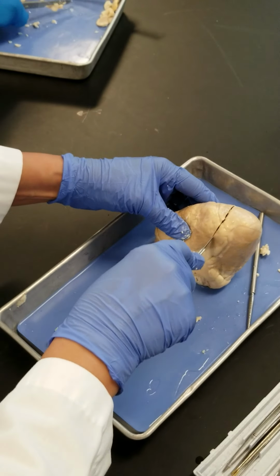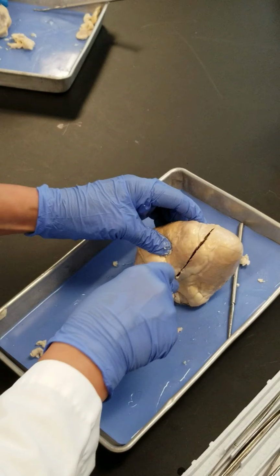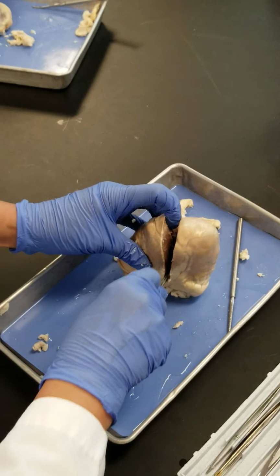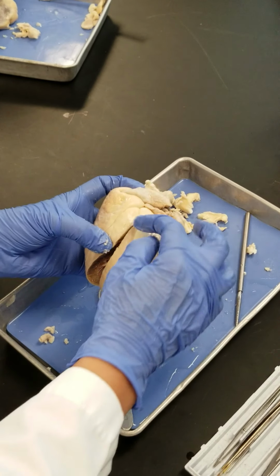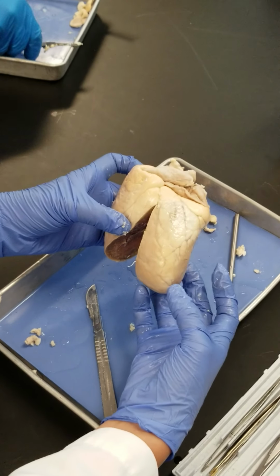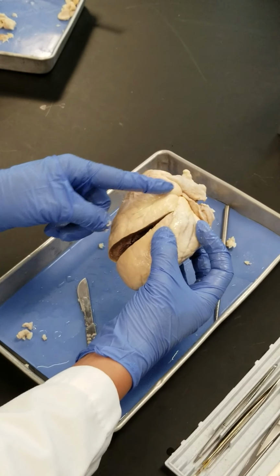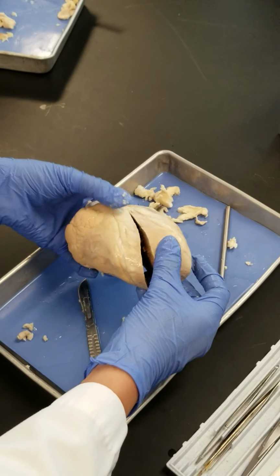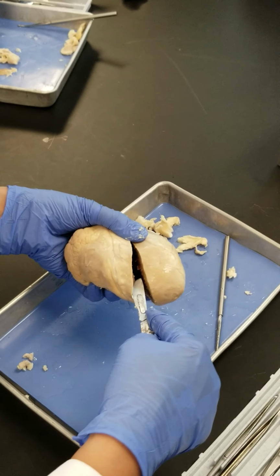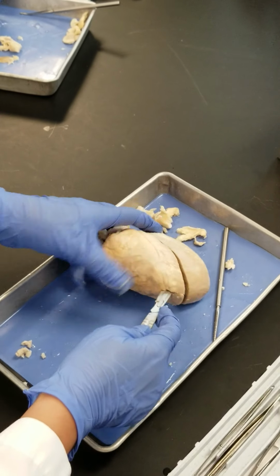Going all the way, just continue parallel to the anterior and separate them completely. So in this way, now don't go all the way up, right? You want to keep the upper side connected, right? So you're separating this part of the left ventricle from the rest, where you have the anterior interventricular sulcus, right? Now you go to the right side and you do one on the frontal or coronal plane.